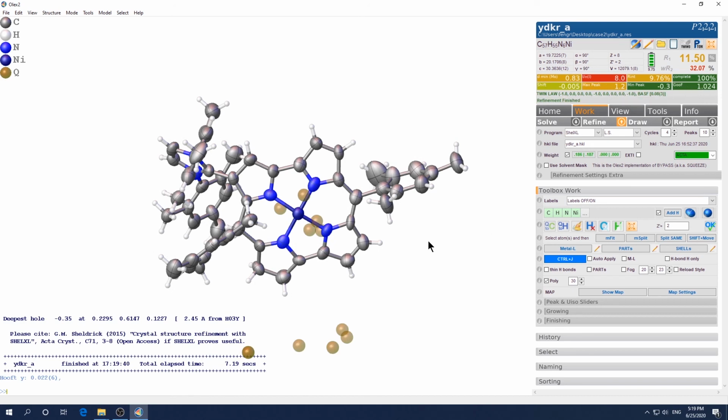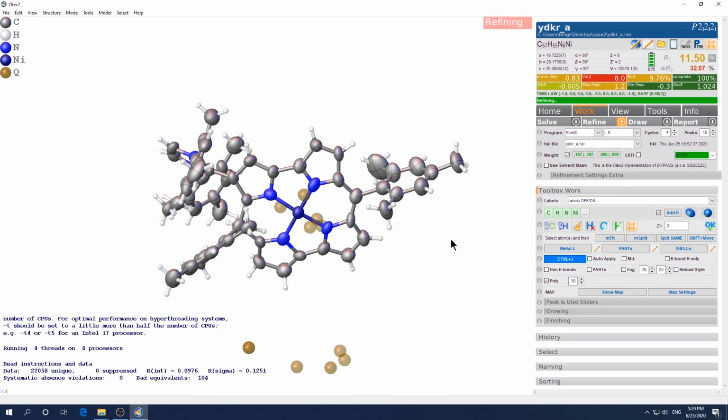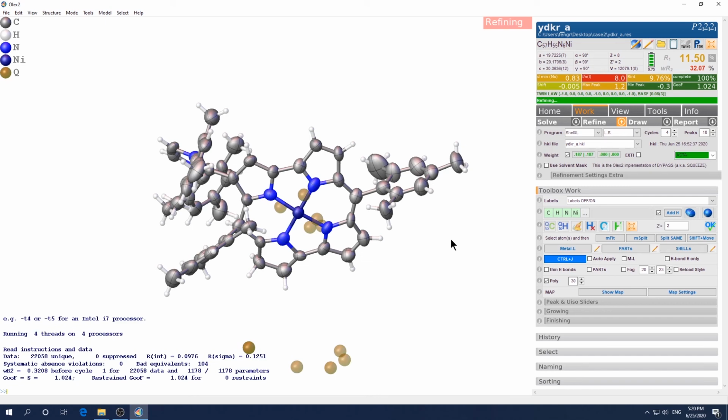So in a real scenario, you may not need to use twinning to account for that Flack parameter because, one, that Flack parameter is small enough, like 0.0 something. Two, the ESD for that Flack parameter is also big enough that it makes this Flack parameter statistically not reliable. So you actually can discard that. You don't need to care about that. Okay, so I think that's what we can do so far.